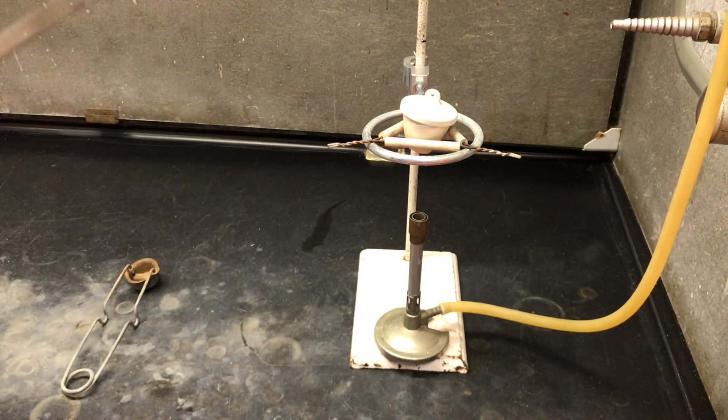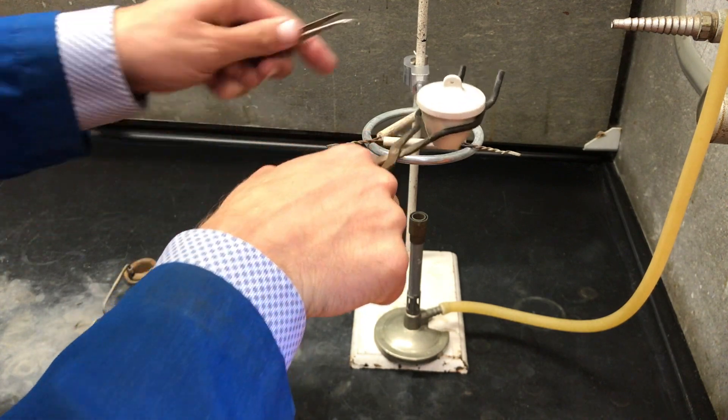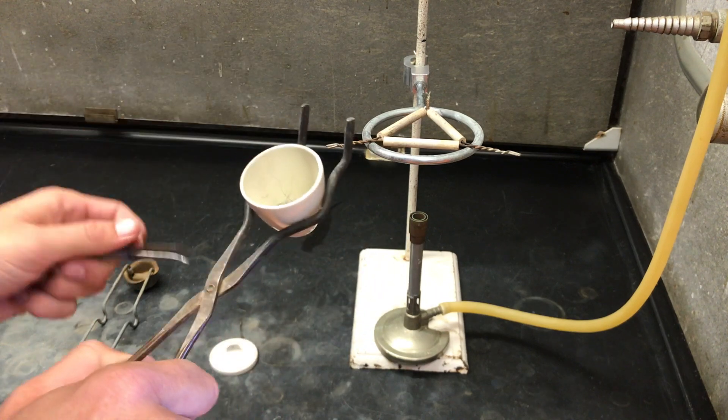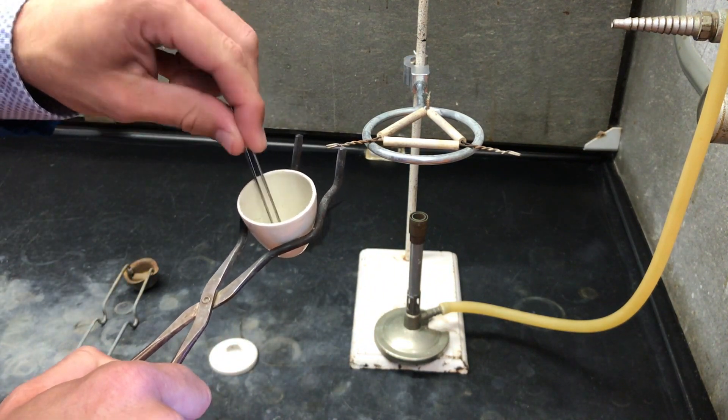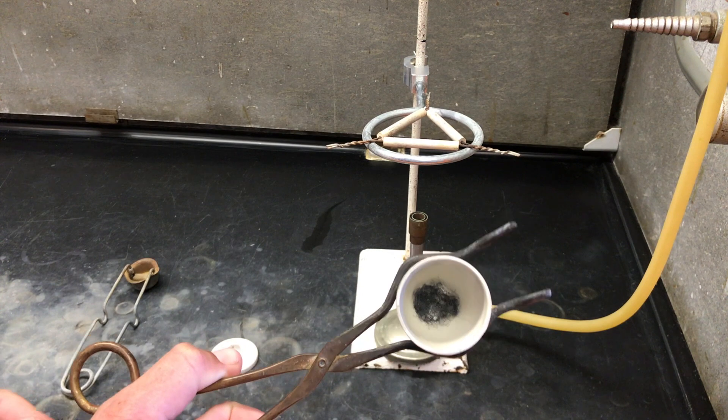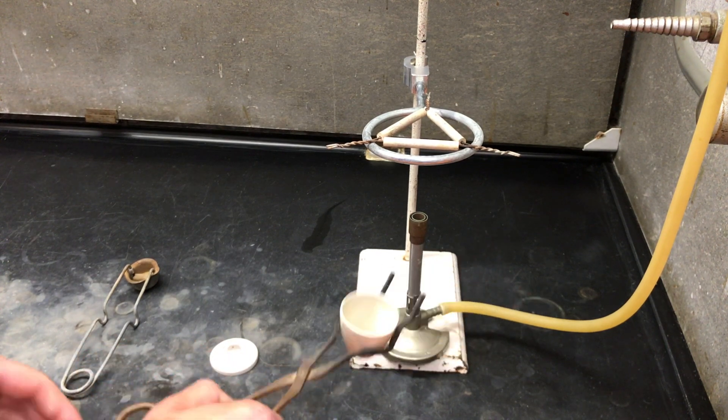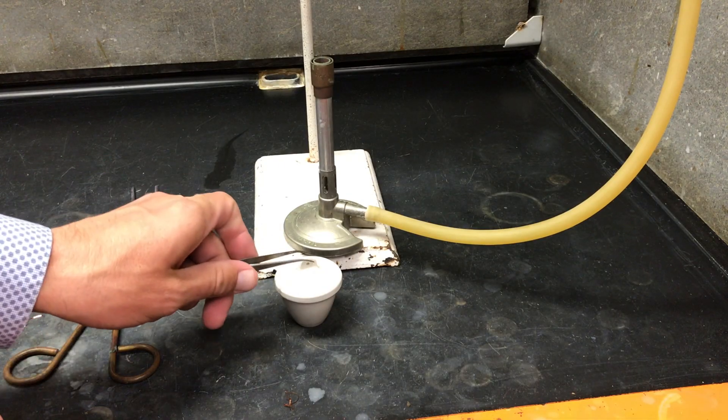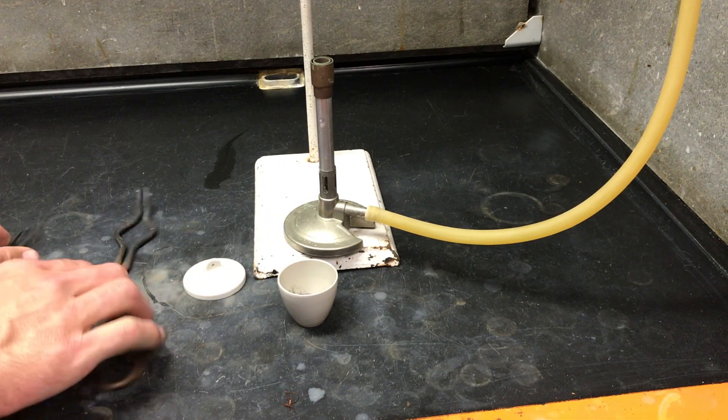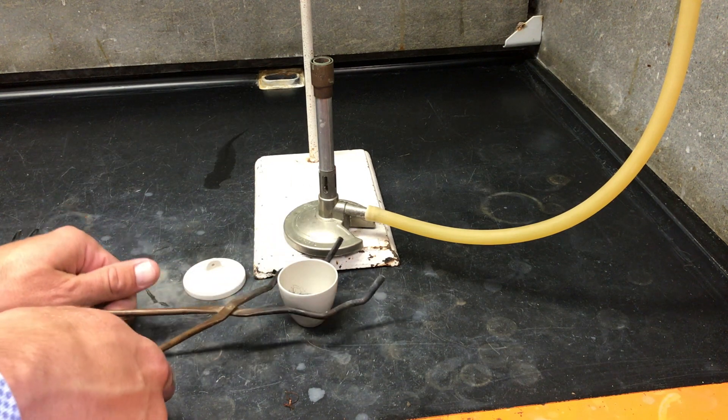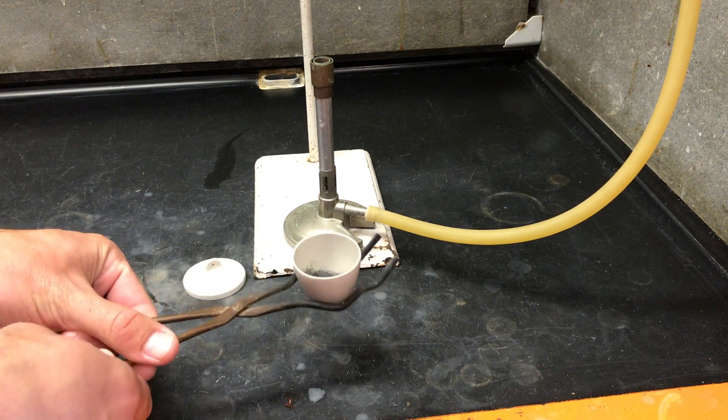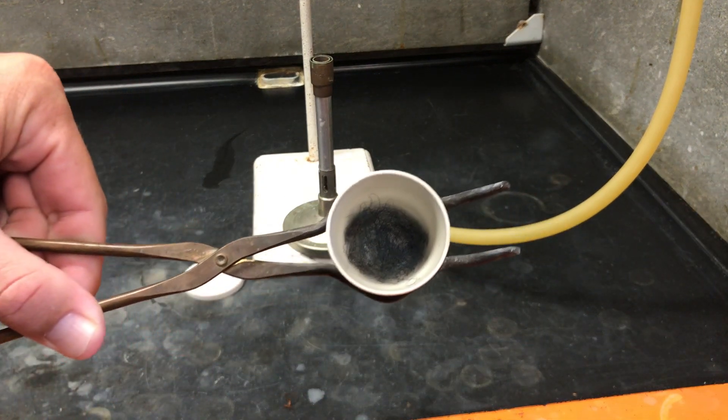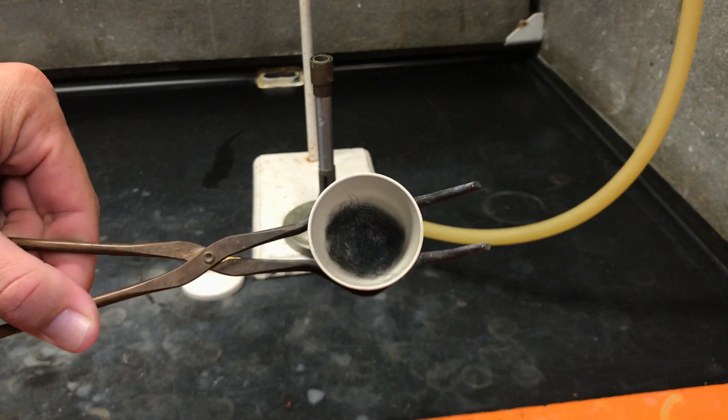Turn off the Bunsen burner, mix your materials and allow them to cool to room temperature before making your observations. Dispose of the waste in the labeled container and wash your crucible.